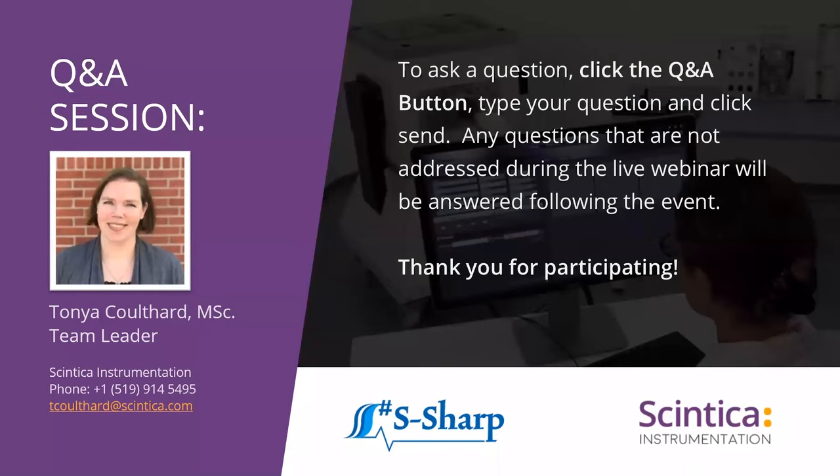But again, most people are making their measurements for cardiac function on M mode images, and that frame rate, or sampling rate, because we're looking at a single line, is 3,500 scan lines per second. So that's a much higher frame rate or sampling rate if you'd like to do the measurements on the M mode image.